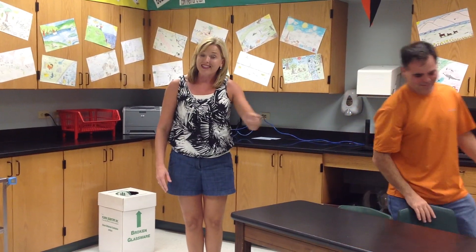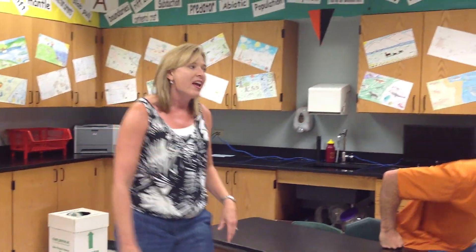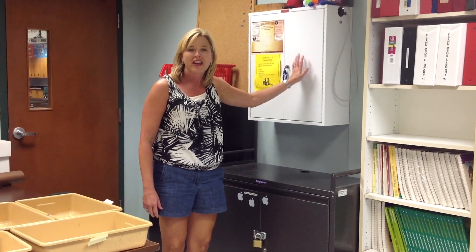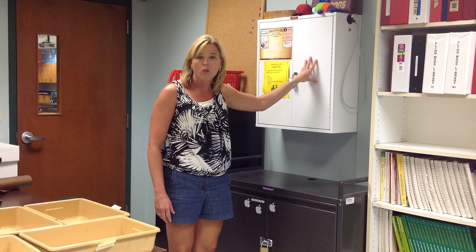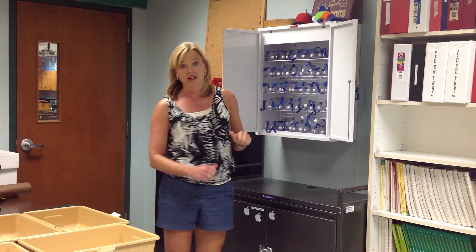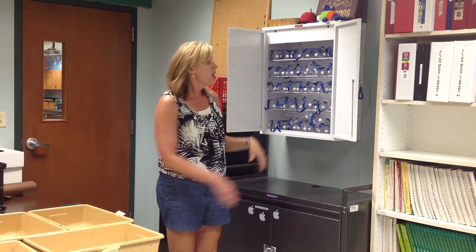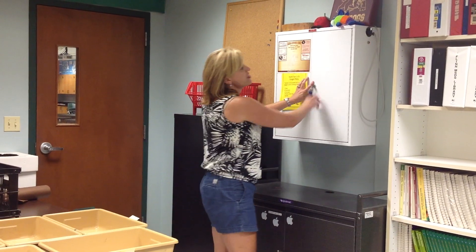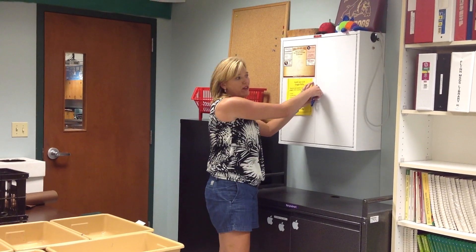What are we going to do to prevent that eye injury from happening? In every classroom, we have our goggle cabinet where we keep our goggles. We'll always wear goggles any time we're dealing with glassware, heating liquids, or working with chemicals. The reason we keep them in this goggle cabinet is that it's the cootie killer. After we've worn our goggles, you will be expected to put them back in nice and neat, and there is a sanitation lever that we run between every class.